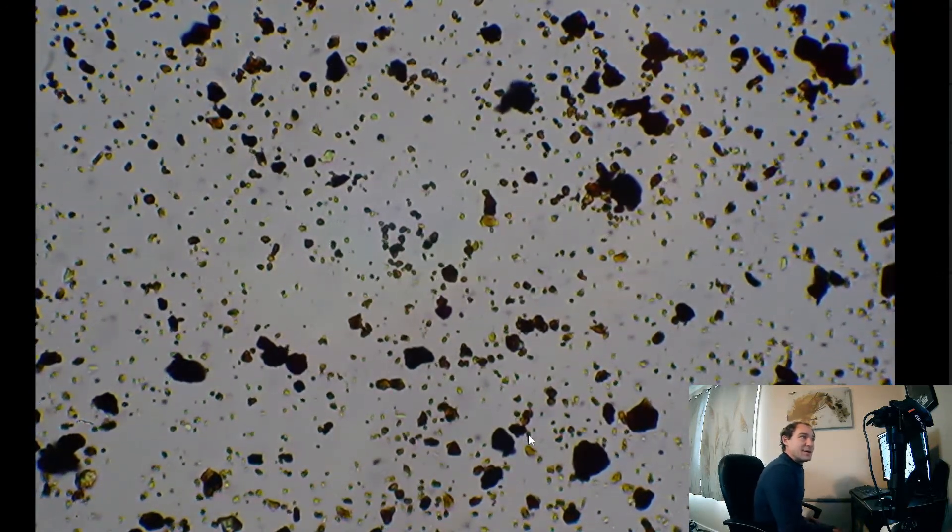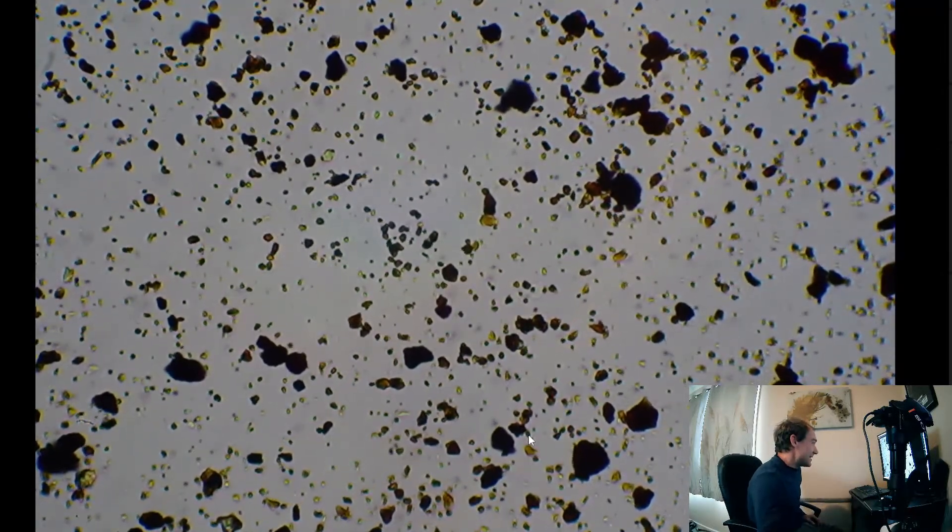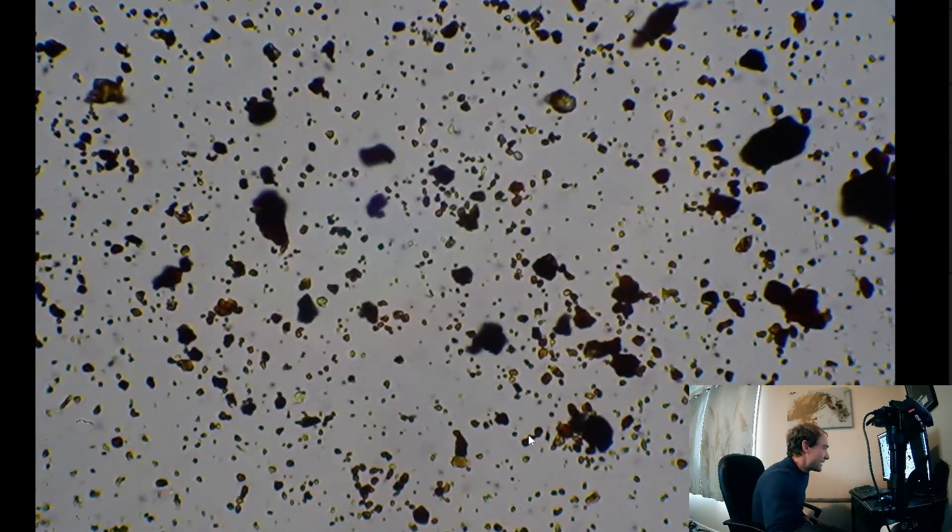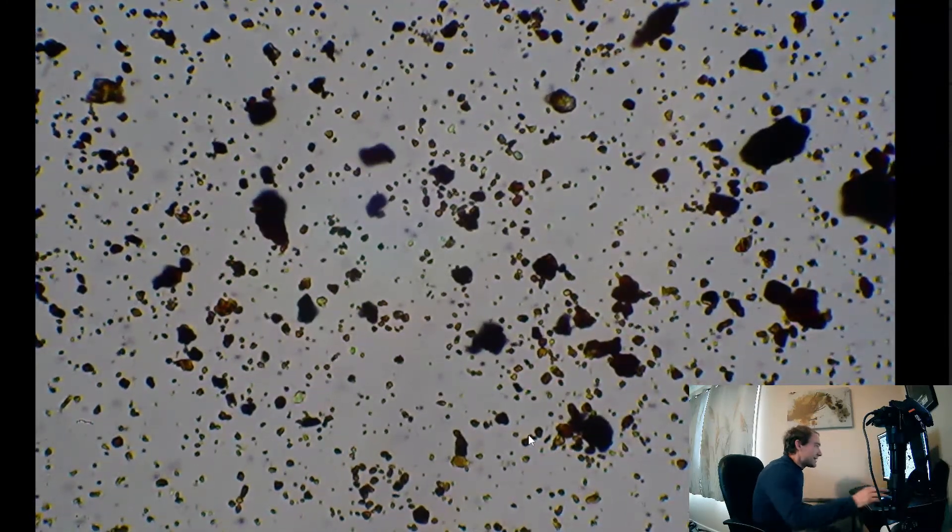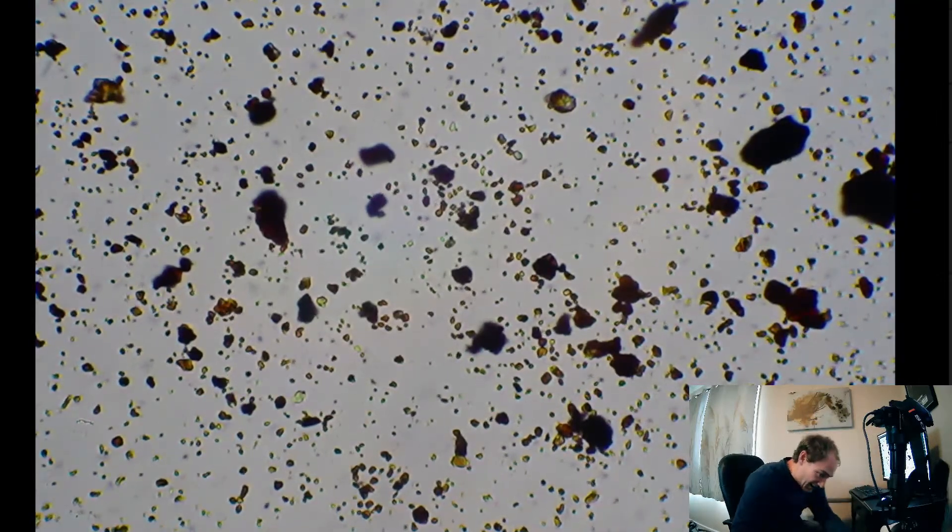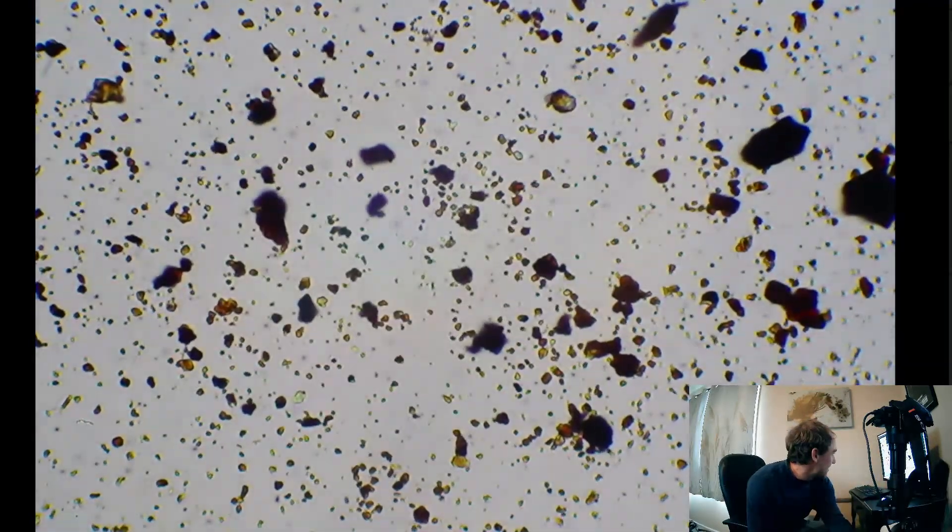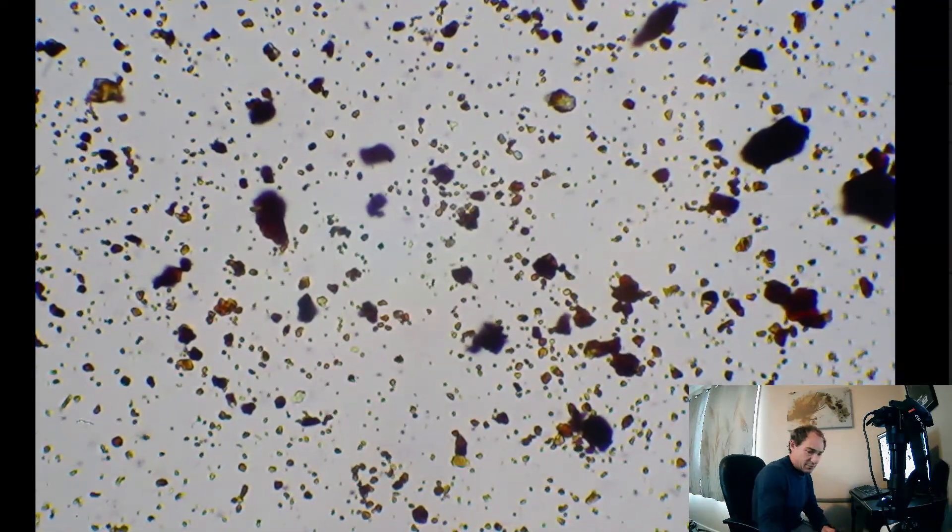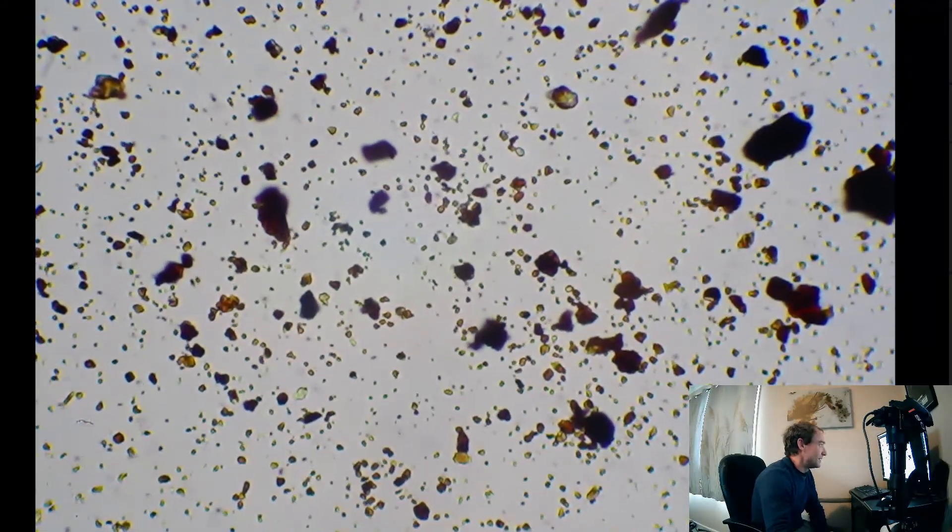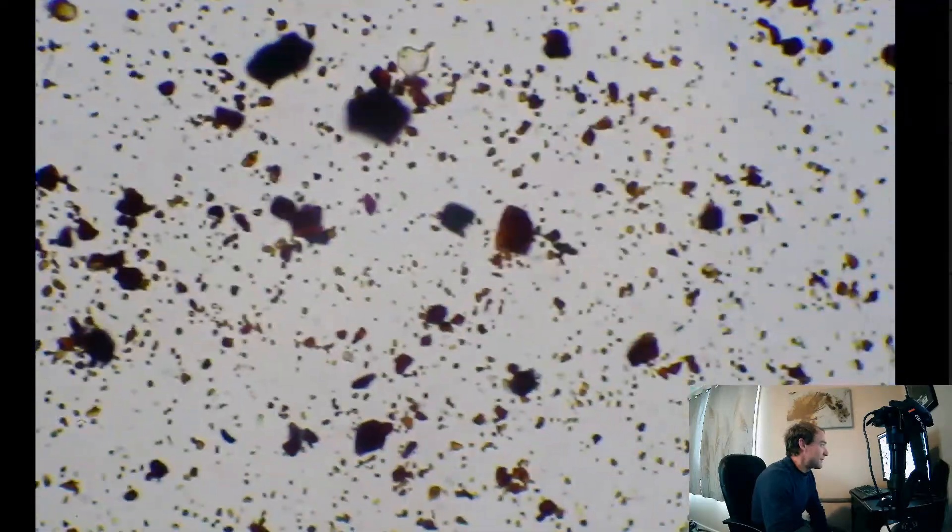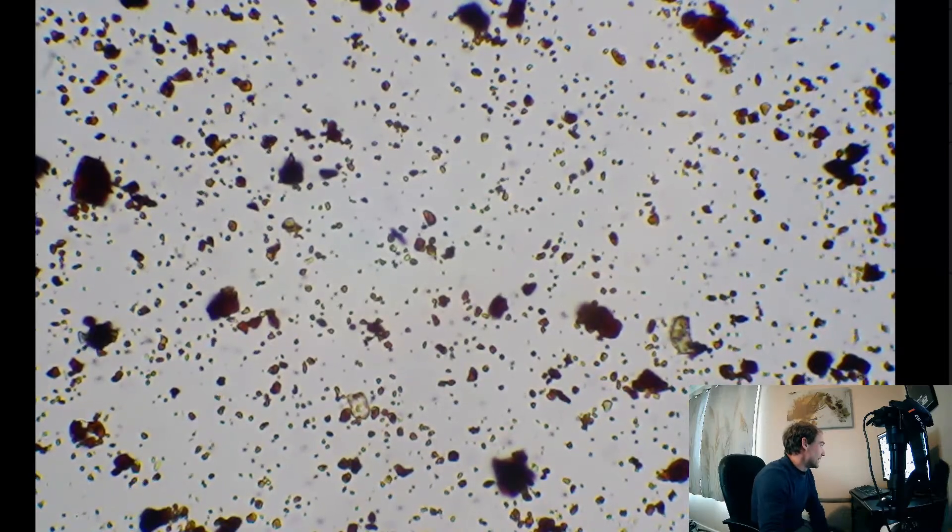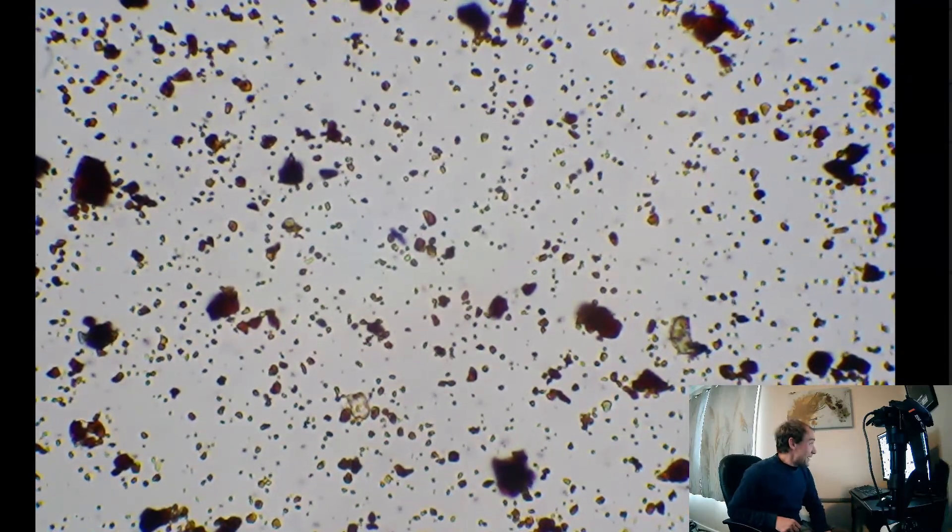Hello Vince, hello William, good to see you guys here. We're seeing a lot of wiggly shapes of bacteria down here. Let me increase the brightness a little bit. That's a whole lot of wiggly little bacteria down there.